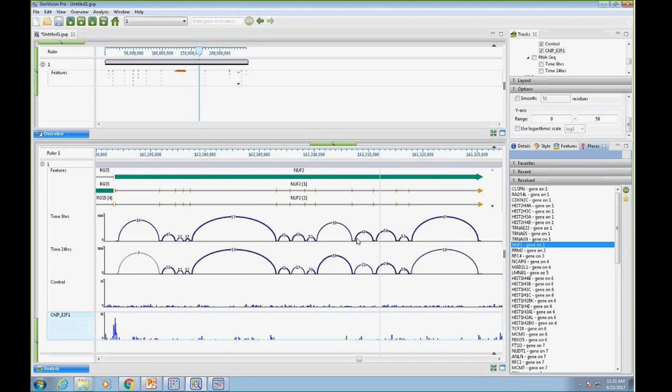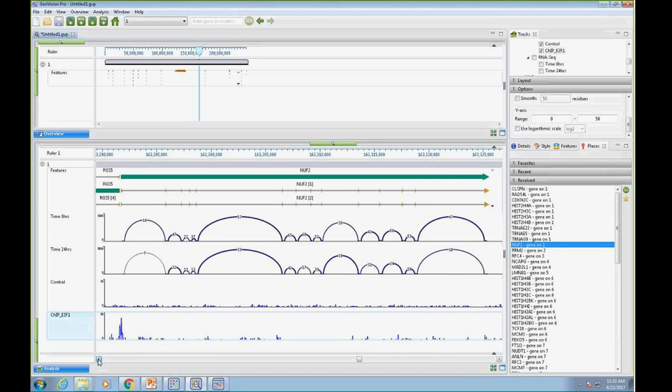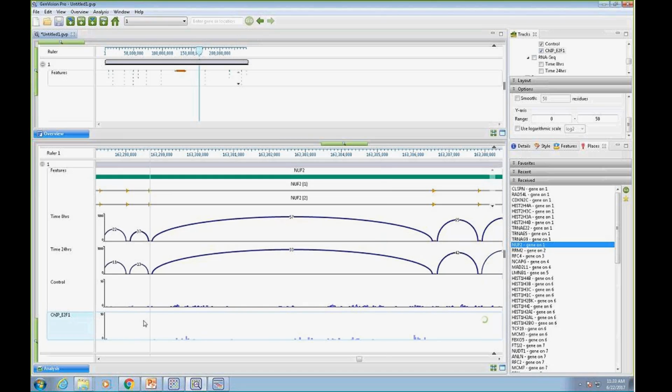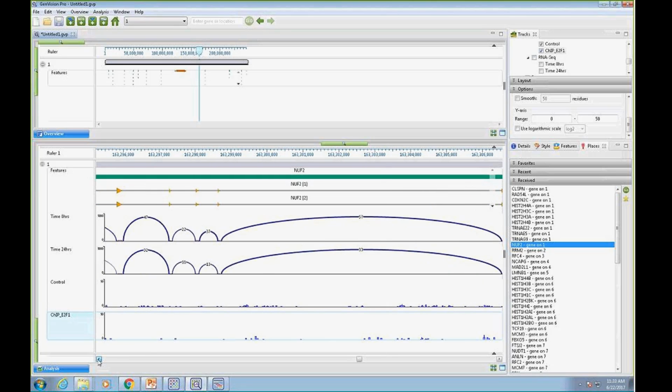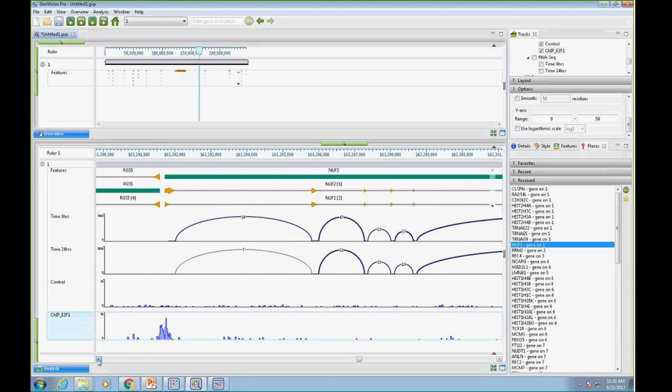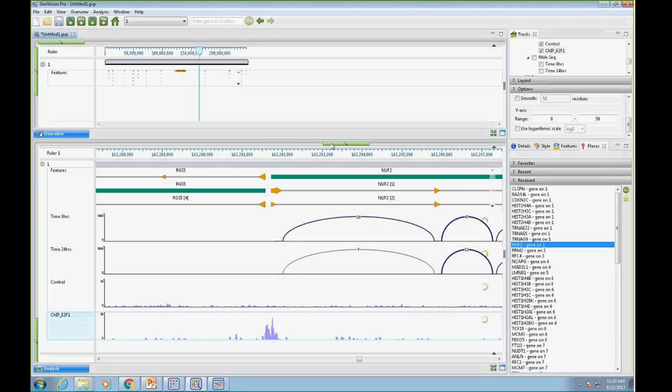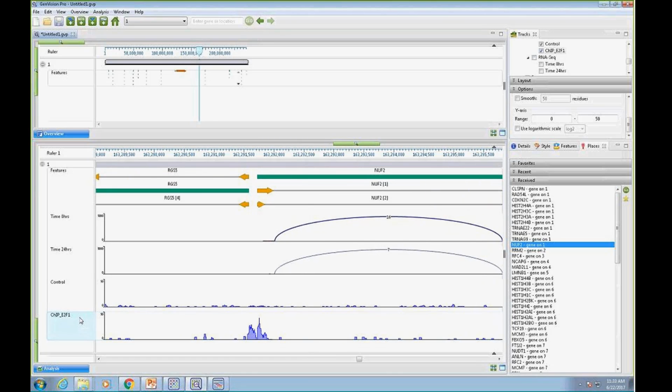And here you can see the peak there, so it's just sometimes a matter of navigating a little bit. And of course you see arcs there. Those are split reads that go between isoforms. So we have an earlier webinar that we did on isoform analysis.